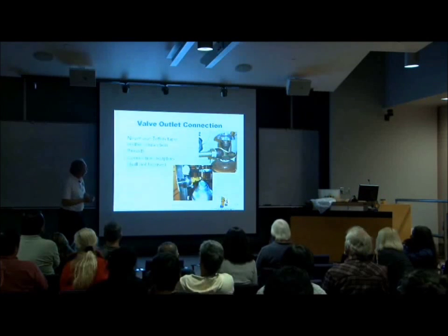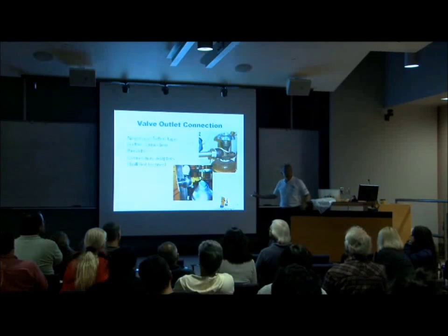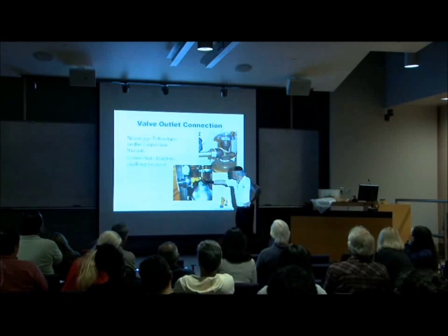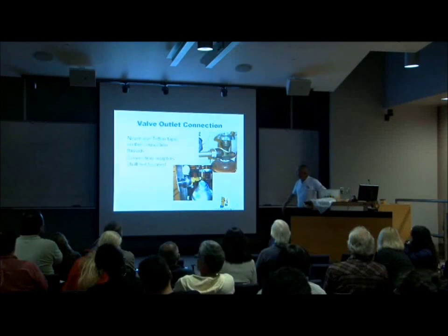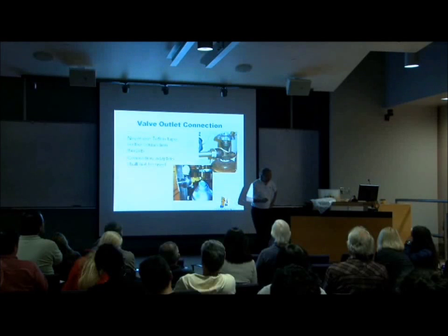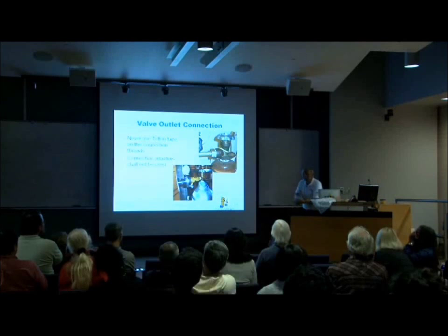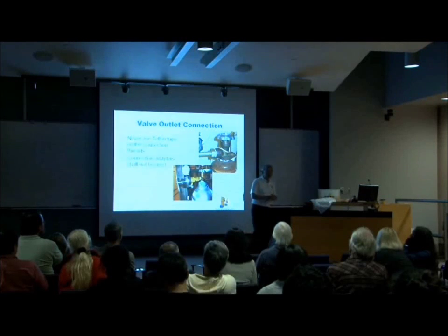So yesterday I took a picture of someplace that had Teflon tape. It's a very common mistake that people make, okay? I walked around another lab, a national lab, and I found this, but what else? This researcher made a bunch of adapters to adapt to the regulator. What else did I see? This is a station regulator. A station regulator can only take a pressure of 200 psi. Cylinder's 2,000. The researcher was trying to save money, and I said, well, when you open that valve, that thing's going to explode.